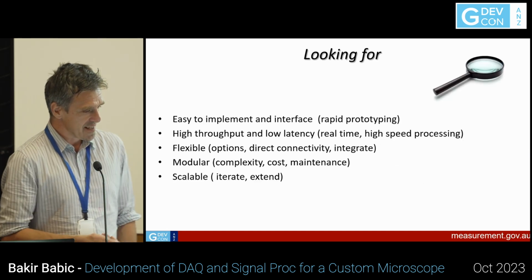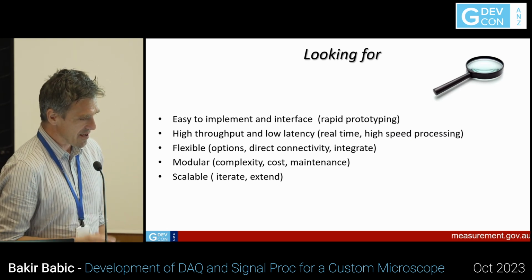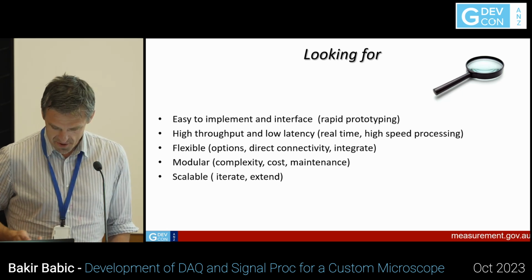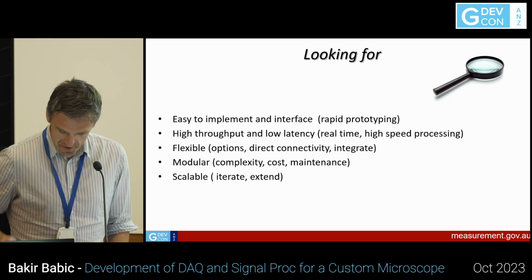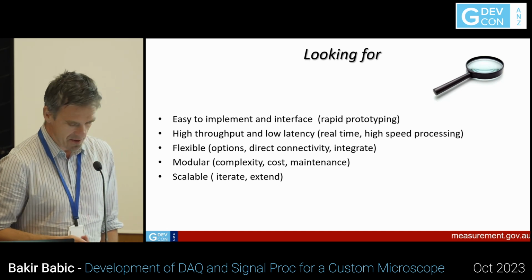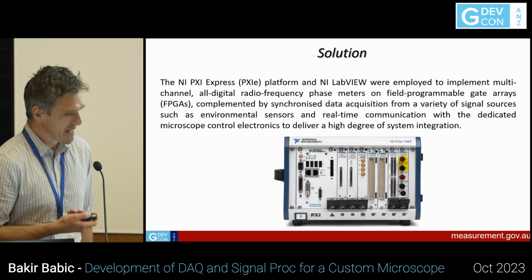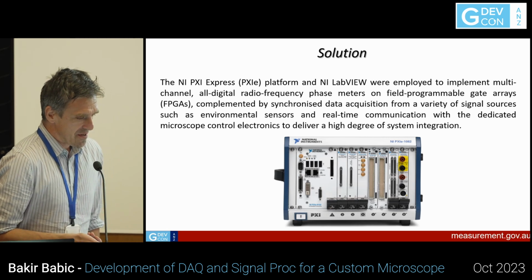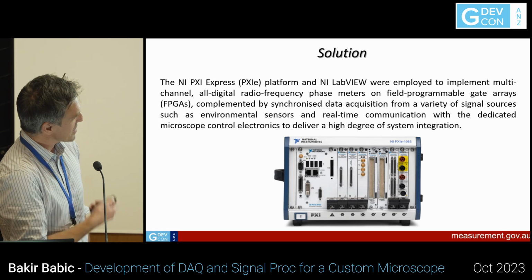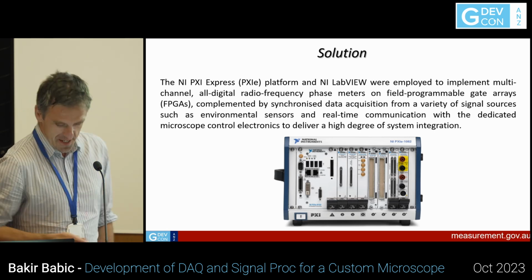Okay, so as I said, it's challenging how you integrate all these things together and get it going. And we thought, for different reasons, but primarily because it is scalable and modular, we found this PXI solution, which offered us the opportunity, by putting in different kinds of cards, to do all that we need to do.